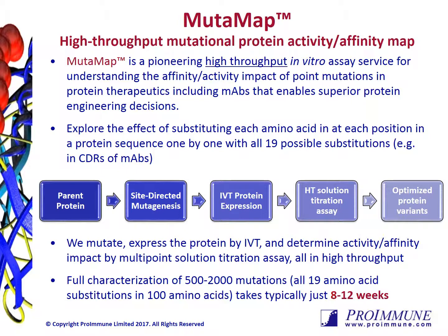Molecular evolution techniques, such as phage display and other phenotype-genotype coupled randomization techniques, are most commonly used in the affinity maturation process for monoclonal antibodies and other binding scaffolds. The advantage of these technologies is that they help explore a very large sequence space of combined mutations.